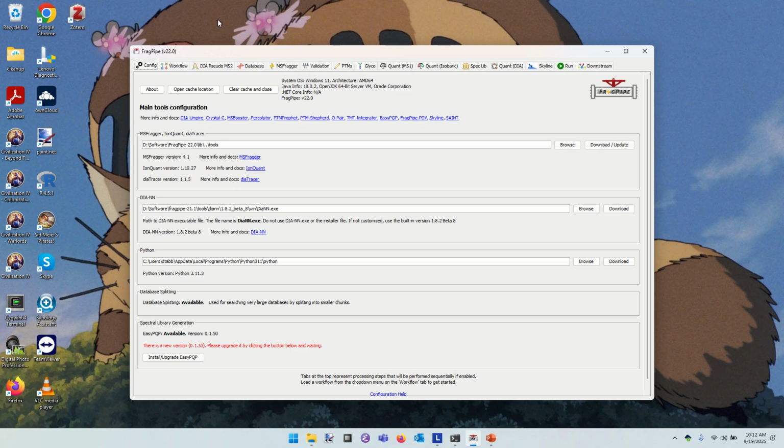Yeah, I think I'll have to separately install because I have the NA for all of the... It'll be the same. But I think if you click downloads next to it, then you have to register as an academic account or something. That should be freely available. Like the top one. Yes. So if you need to get these tools in place because it doesn't show versions, the download and update feature should take care of that for you. But you will have to fill in a form and get a verification email sent to you. I don't think it requires a verification anymore, does it? Oh, does it? Okay. But if you put in your work account or other educational institution, they will send a link to that. And it's like a 6-digit code.